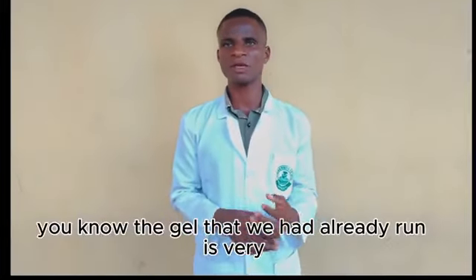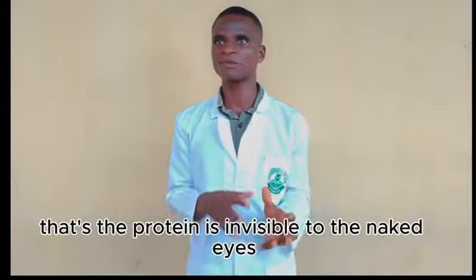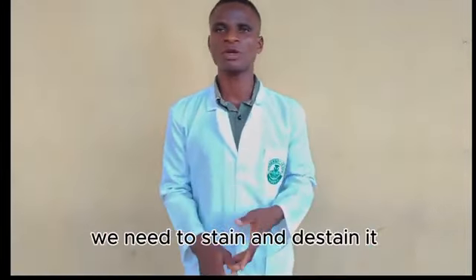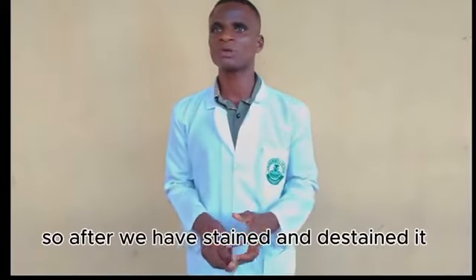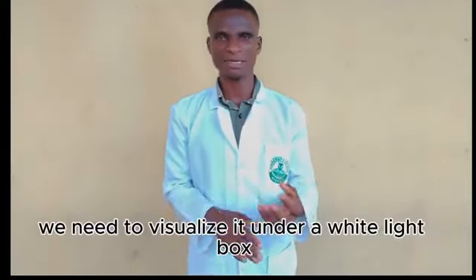The gel that we have already run is very invisible. That's to say, the protein is invisible to the naked eye. So for us to make it visible, we need to stain and destain it using a proper staining solution and a destaining solution. So after we have stained and destained it, we need to visualize it under a white light box.